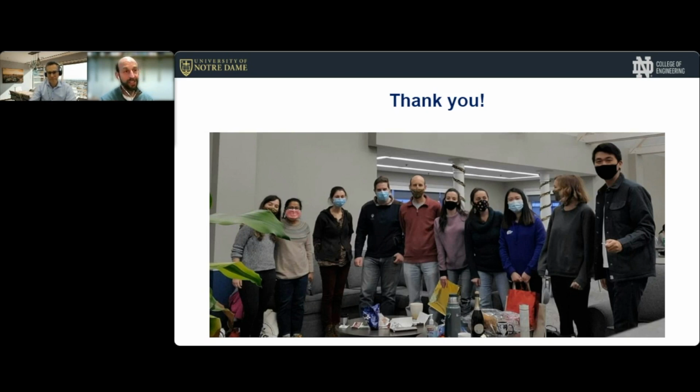Okay, that's a good question. I think if you were to use a thick biofilm, you probably would run into that problem. You would run into the problem that your signal is attenuating, and you may get dark areas that are dark because your signal isn't penetrating. In our research, though, where we tried to relate the OCT signal intensity to the mechanical behavior, we chose thin biofilms. So we didn't have a concern about signal attenuation within the range that we were exploring. But definitely that is a concern for thicker specimens or very dense specimens.